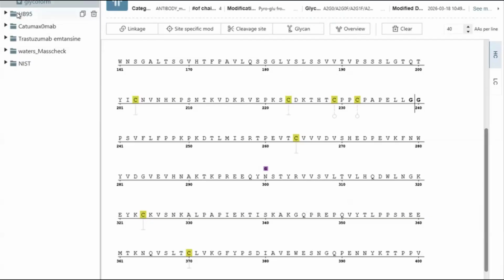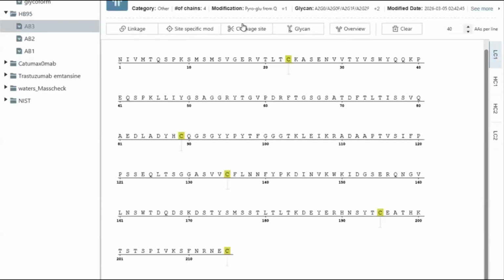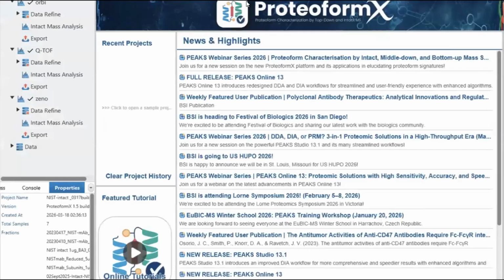And also you can define an antibody group in this software. For example, here we have an asymmetric chains antibody. So you can see we defined those two different LC and HC. Then we go. Okay. Then we continue with the configurations here.